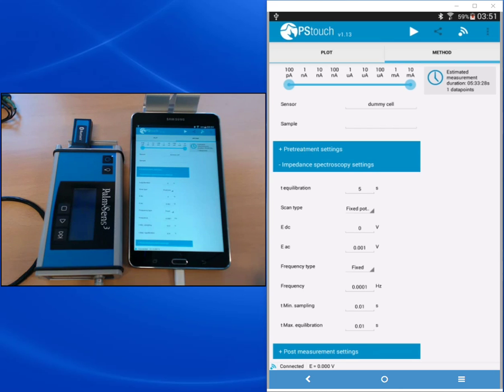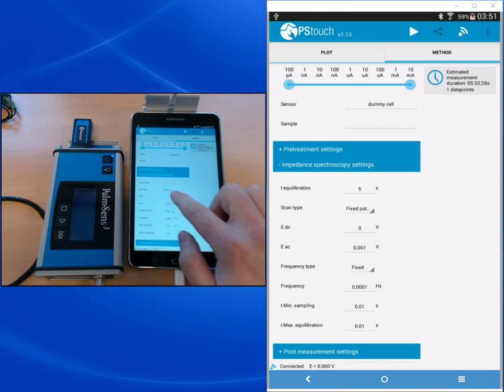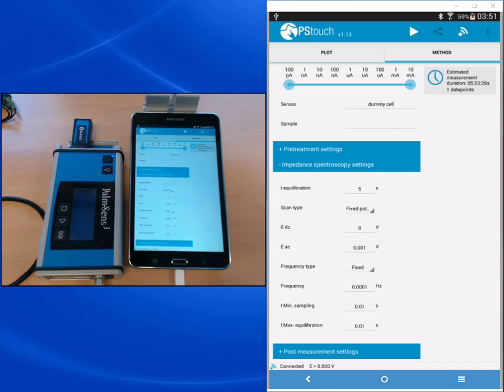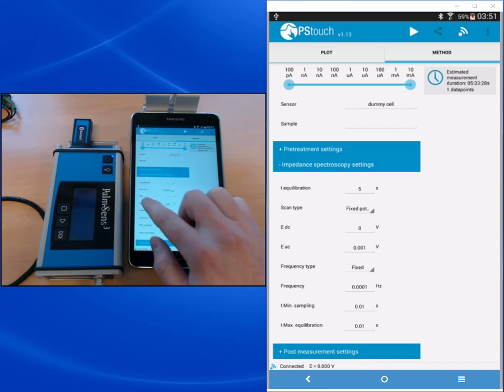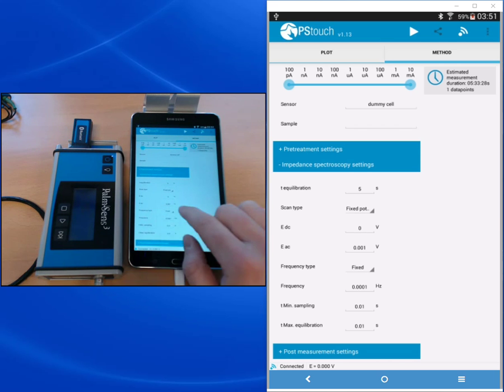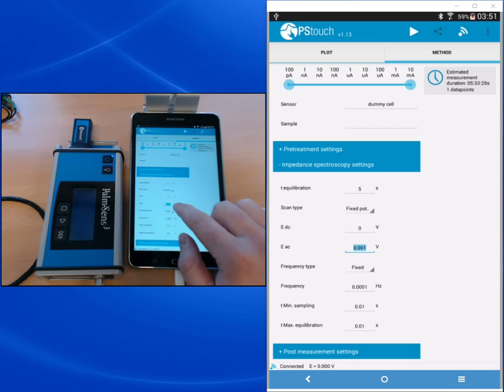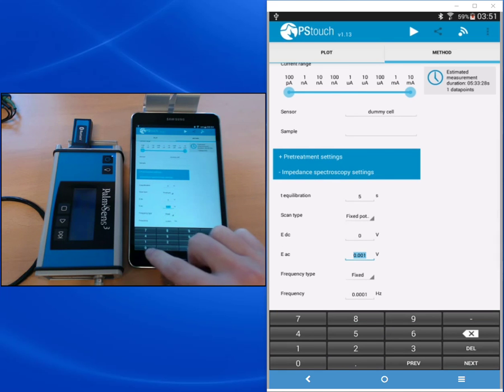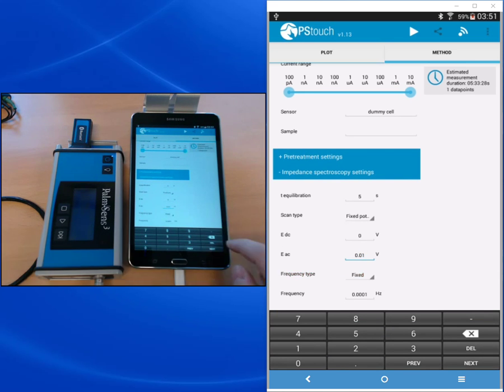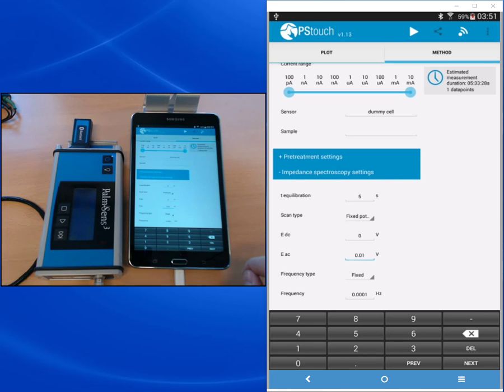Our fixed potential, the EDC, will be zero volts because that's the OCP of a demo circuit. As amplitude, so as EAC, we choose 10 millivolts. Typical values for impedance spectroscopy EACs are between 10 and 5 millivolts. Also other values are possible depending on your experiment.